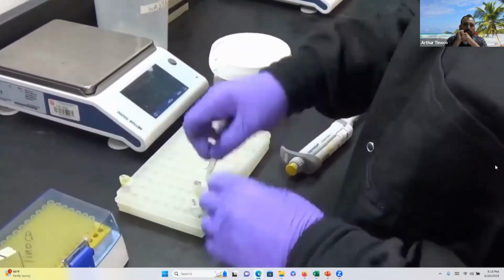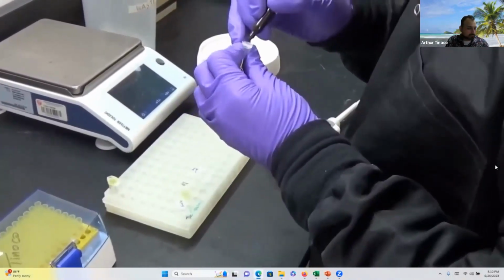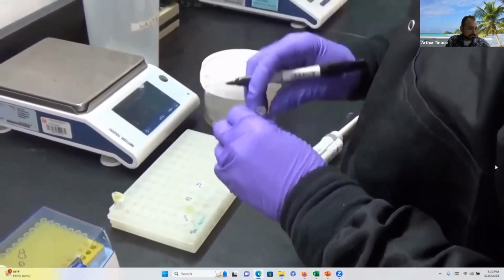It is always a good practice to label your sample epis, especially when you have many samples to keep track of.